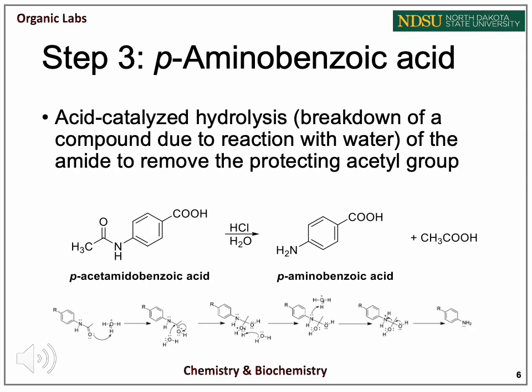The final step of this reaction is a deprotection step. This is necessary because now that we have completed our oxidation successfully, the only thing standing between us and our desired product is our protecting acetyl group, so it must be removed. We will be doing this through an acid-catalyzed hydrolysis, the mechanism of which is shown below. The basic goal of this reaction is to remove our protecting group without affecting the rest of our molecule.